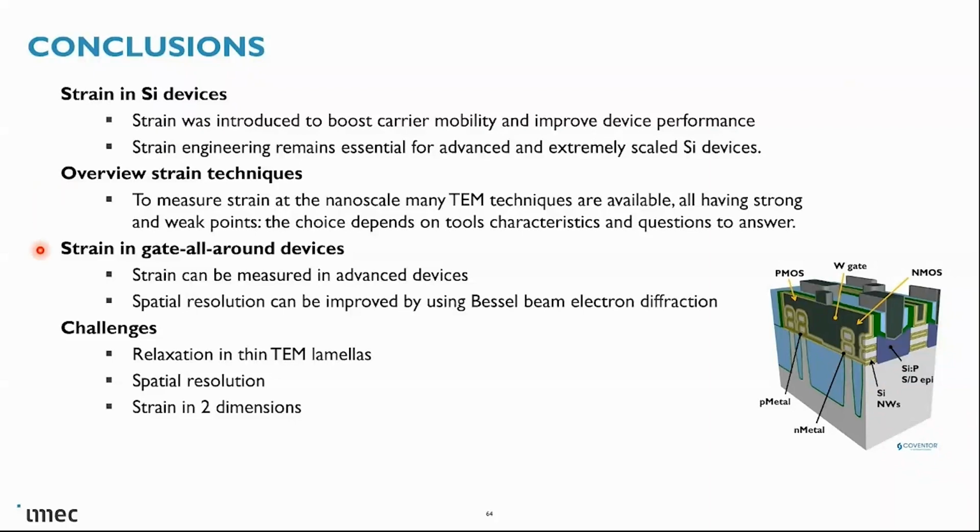I showed you an example of measuring strain in gate-all-around devices. So it is possible to measure strain in advanced devices, and the spatial resolution can be improved, for example, by using the Bessel beam electron diffraction.